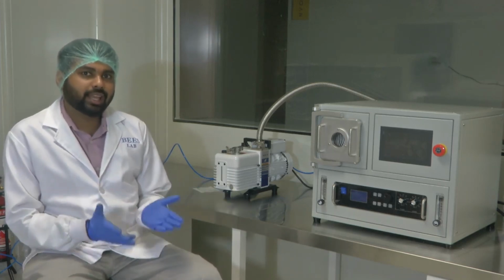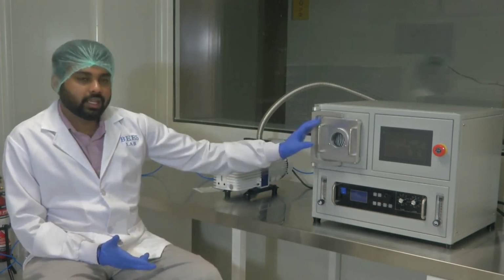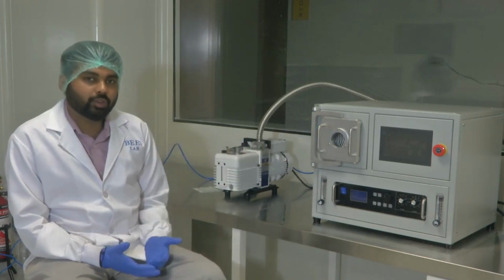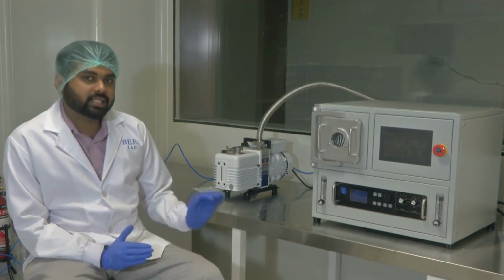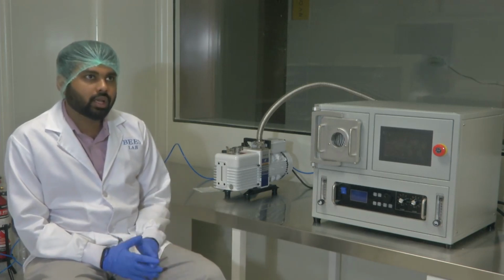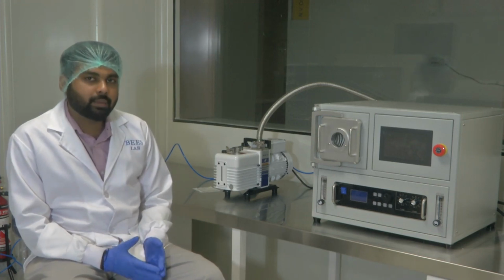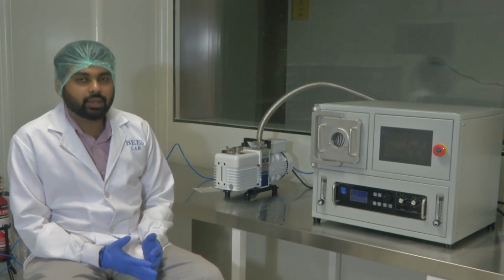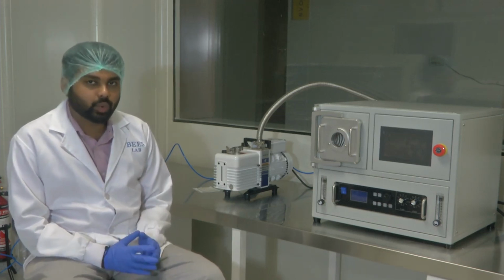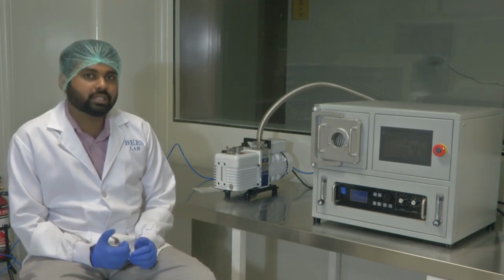As you say in Spider-Man, with great power comes great responsibility. This is a very powerful system. We can have a lot of uses, but you should handle it with care. One part of handling it with care is understanding what is going on. If you are handling an equipment, there are two ways of handling one. Somebody can be trained to handle an equipment, they will be a technician, and they might not know exactly what is happening, or you can be a scientist who is handling the equipment and you know exactly what is happening, and you will be able to even suggest improvements in how the equipment is designed.